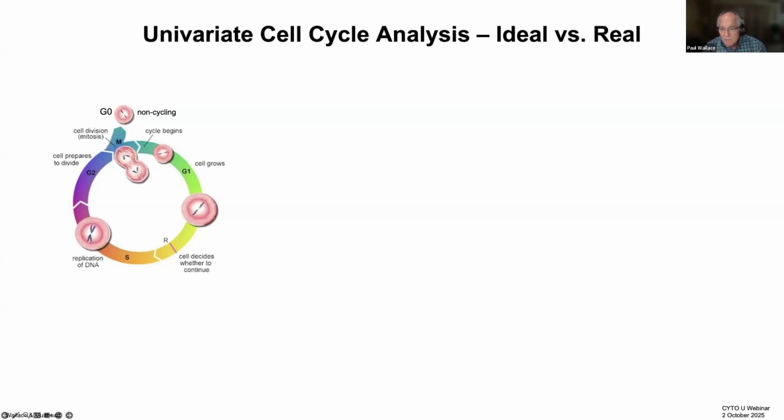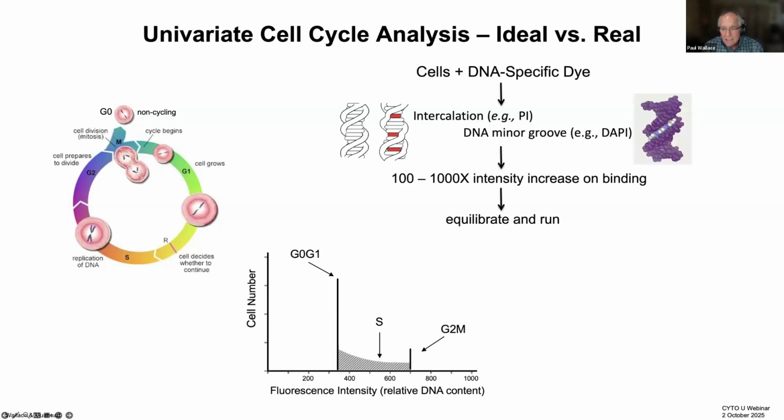So lesson 1 of the CYTO proliferation course reviews the cell cycle as a tightly regulated process by which normal cells grow, duplicate their DNA, and divide to produce 2 daughter cells. A DNA histogram provides a nice snapshot of cell cycle status at a particular point in time. And with a perfect cytometer, the cell preparation method, and saturating amounts of a DNA binding dye, an exponentially growing cell population will give a histogram just like this.